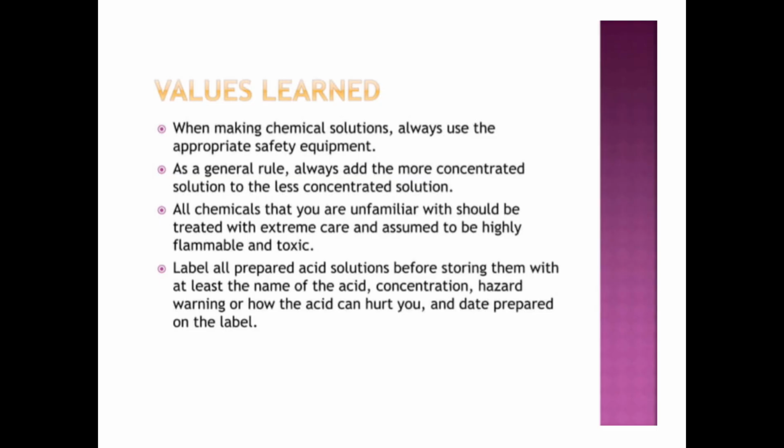For instance, you can put a different sign. That means it's hazardous. If it can cause fire, you put the fire sign. If it can cause a problem to the body, or if it's corrosive, you put the sign, and so on.